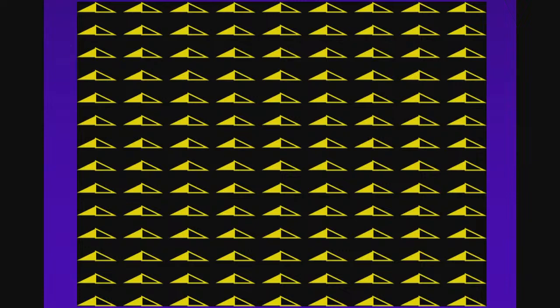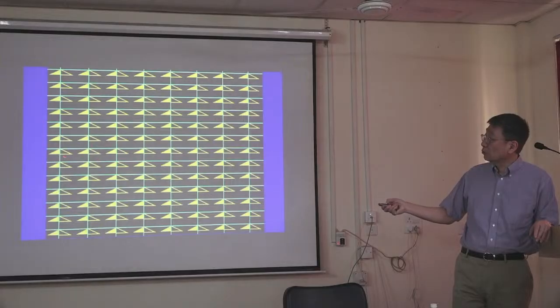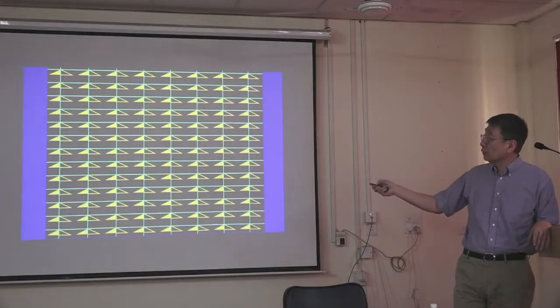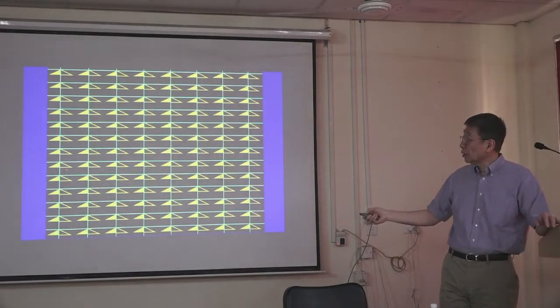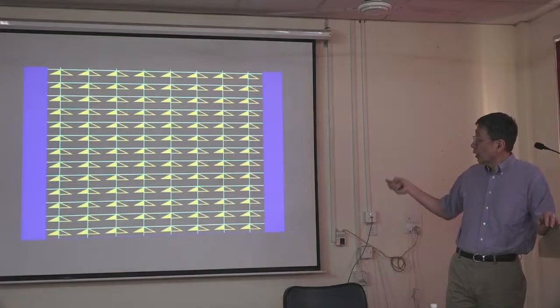So here's a crystal, 2D, okay? You can see this is your molecule translated along the vertical axis and the horizontal axis and repeats infinitely. You can see they're all the same. The molecules are the same, and it's a regular repeat going back in both directions. Then the unit cell, you can say, okay, this rectangle will be the unit cell. That rectangle is repeated over and over again. So essentially, the crystal is made up. You can take the unit cell and stack it against itself in 2D, and then you can imagine the third dimension will be the same. That will give you a three-dimensional crystal. And the content of the unit cell will be this molecule right here.